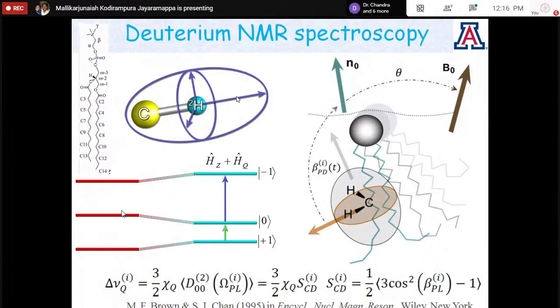But we have to consider that whenever the spin quantum number is more than 1/2, a quadrupole moment comes into the picture along with the Zeeman interaction. That quadrupole interaction again slightly shifts these energy levels, as given here. The details we are intentionally avoiding at this point.